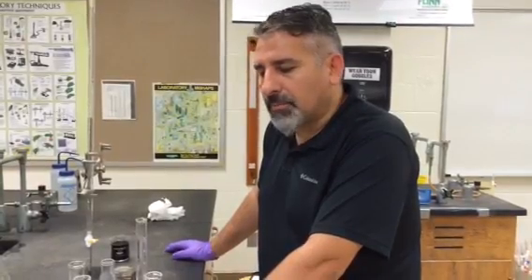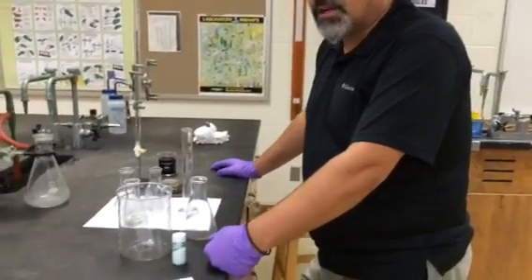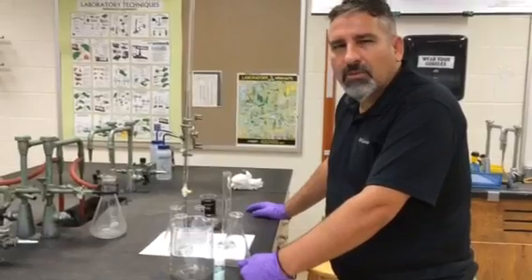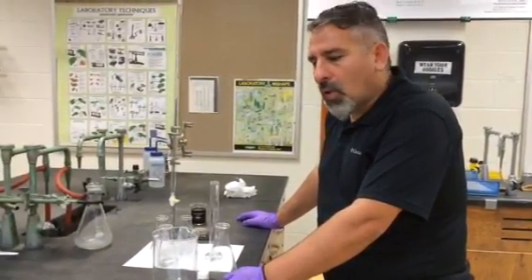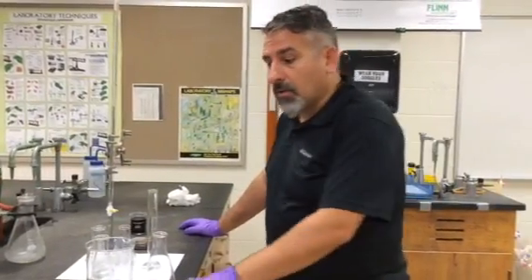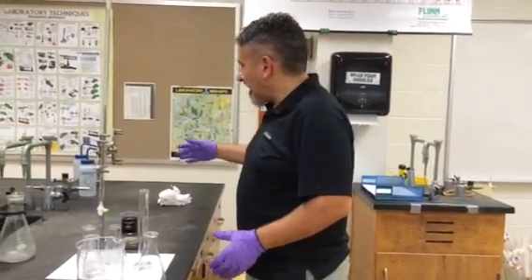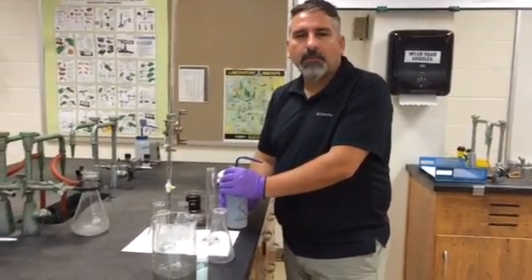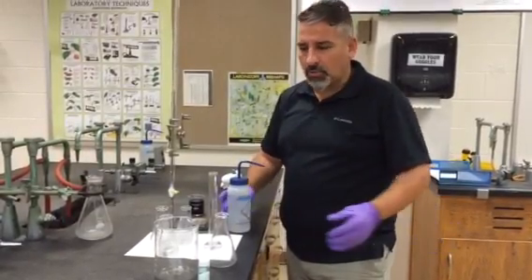Let me start with the preparation of the sulfuric acid. The handout says 25 milliliters of sulfuric acid, but we are cutting it in half. So students are going to use 12.5 milliliters of 6M sulfuric acid, which they will find under the hood, and then 62.5 milliliters of water. Put the water in the flask first, and then the sulfuric acid, in order to diffuse it safely.